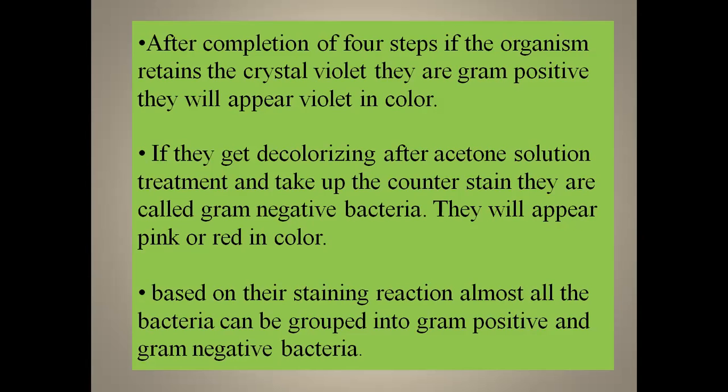Why? Because the cell wall is attracted to and stained with the crystal violet. So even though the decolorizer, the mordant and the secondary stain are added, it will not be displaced. In the initial stage, while we are adding the crystal violet, these bacteria will absorb and retain it.